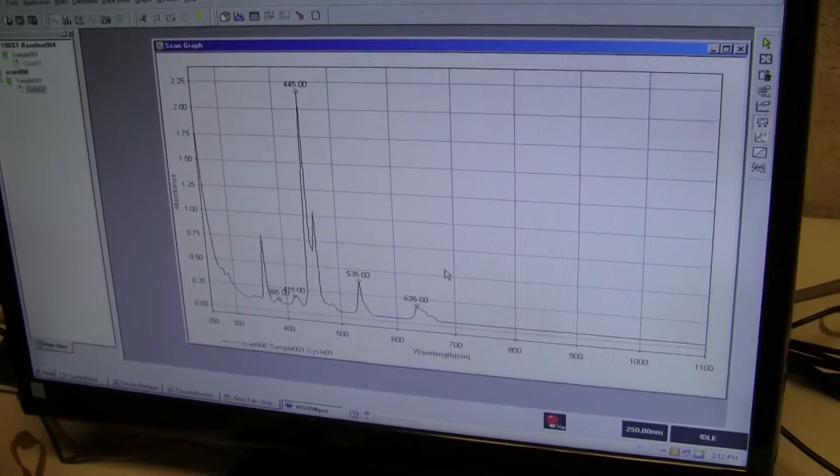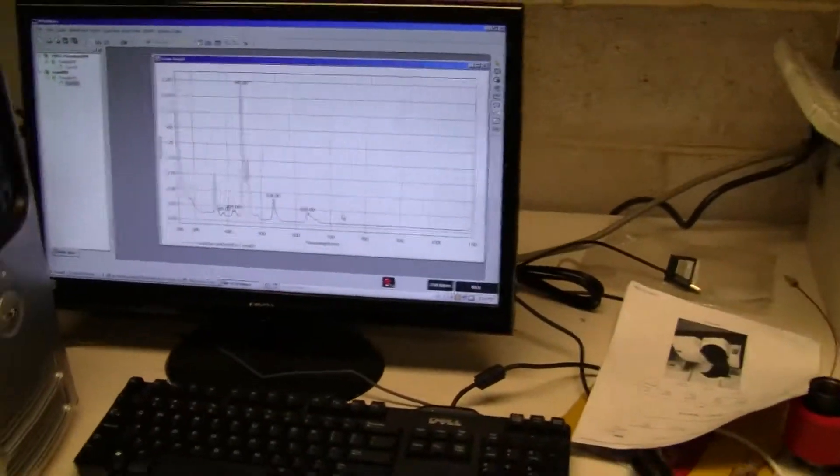There's peaks. The instrument does need to, when it lands, needs to be calibrated and so forth.